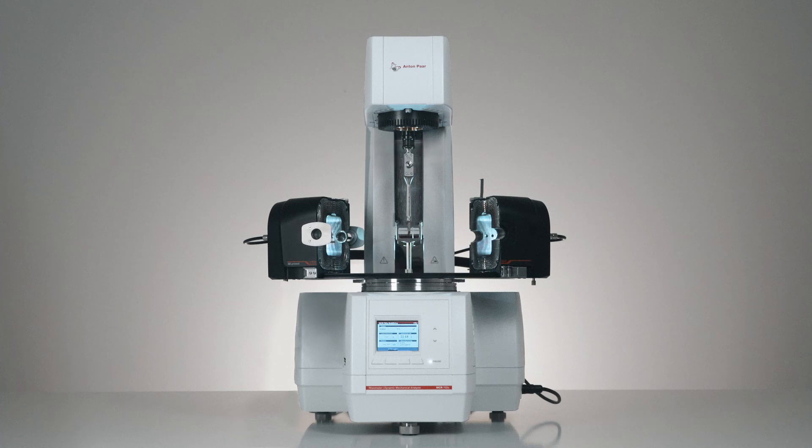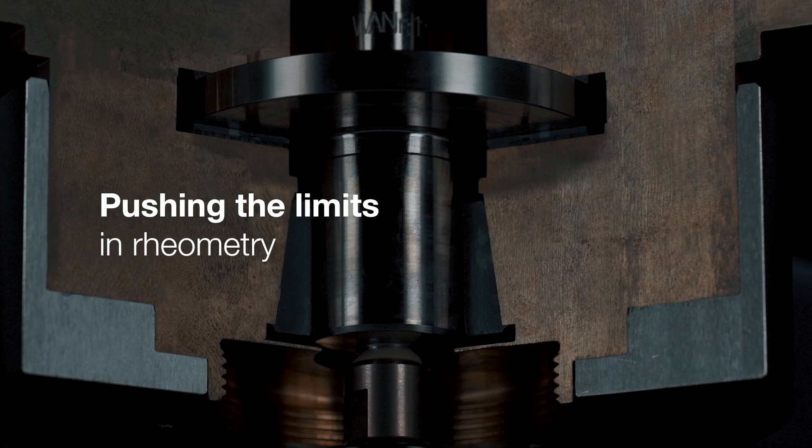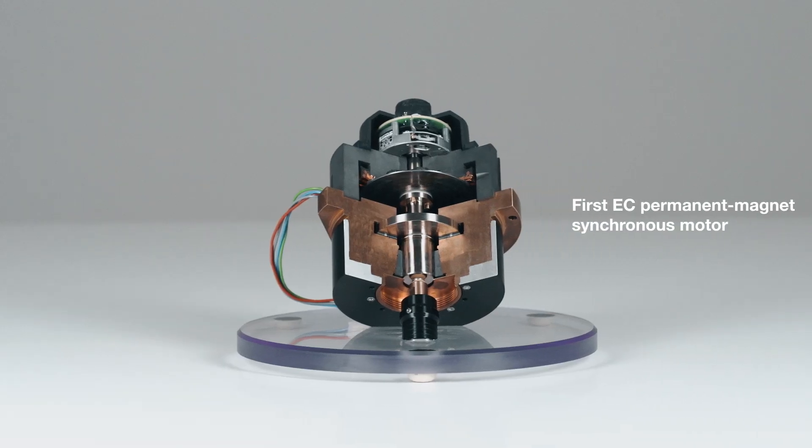Anton Paar was already pushing the limits in rheometry back when we invented the first EC permanent magnet synchronous motor.